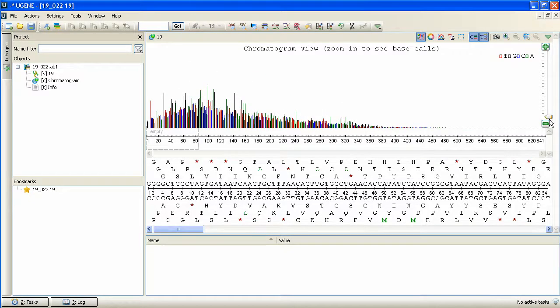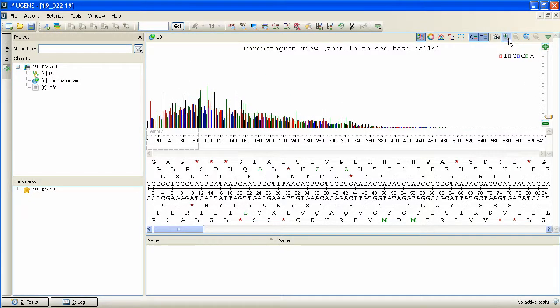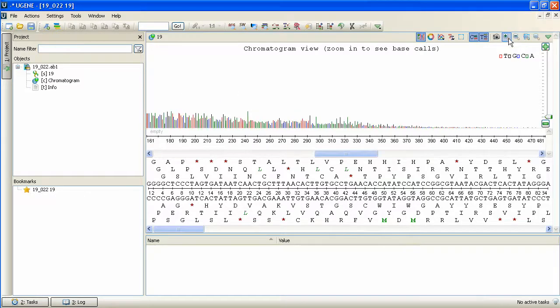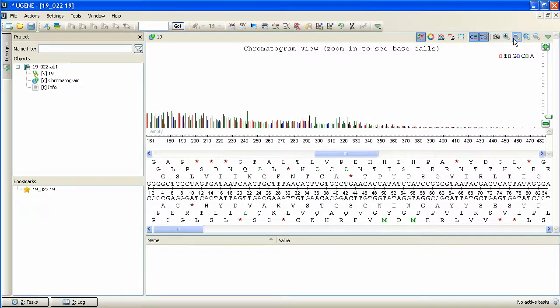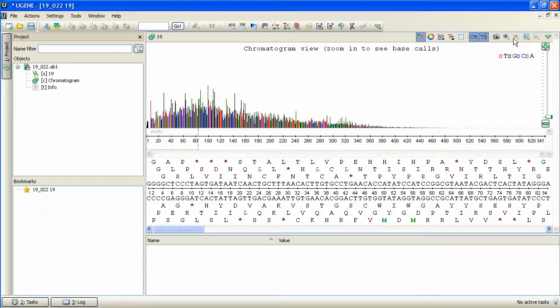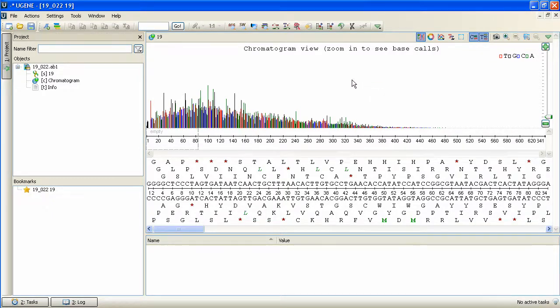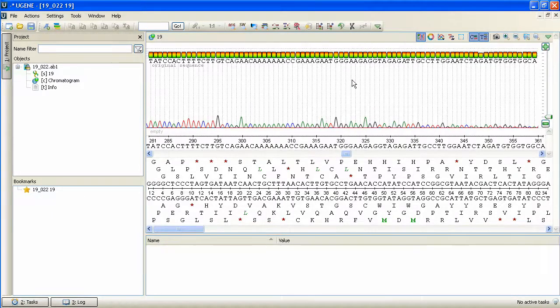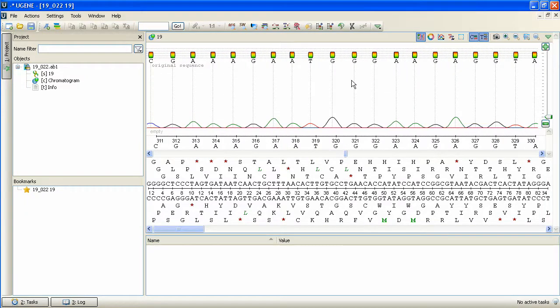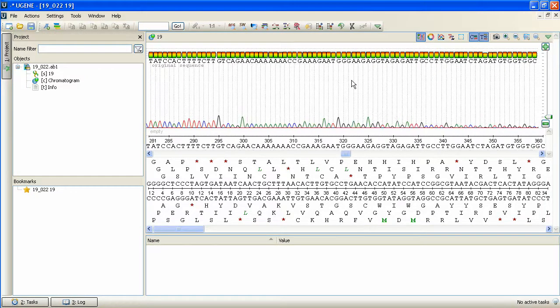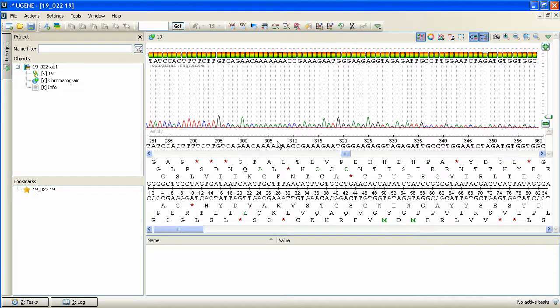Let's zoom in the view to see more detailed information. We can do it by pressing the corresponding toolbar button or by holding the Alt key and rotating the mouse wheel. We see that the panoramic view scale has been changed correspondingly.